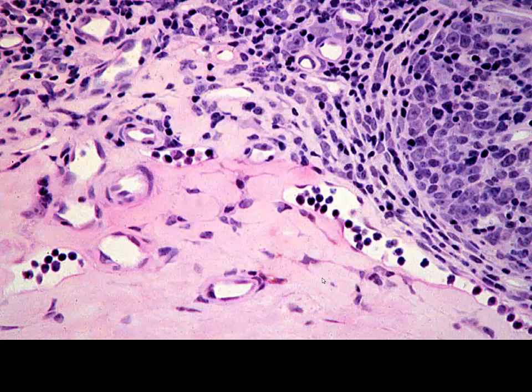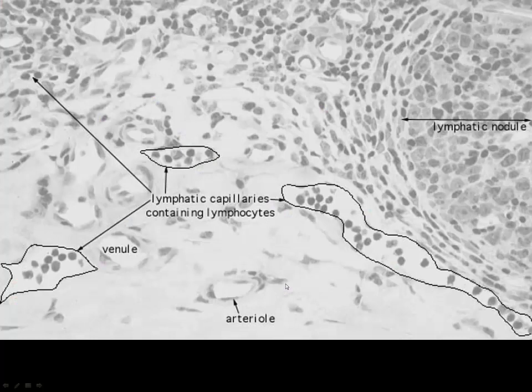This is in some of our connective tissue as we're underlying the mucosa, and here we can see some small vessels, just endothelium. Once again, here we're getting into more of our arterioles and venules. Even though we don't see cells, we might see some. No, I don't think that's red blood cells in there. But these are going to be our lymphatic vessels with all of these lymphocytes, very thin walls built in down in this connective tissue. Here's another section through one of our lymphatic capillaries.